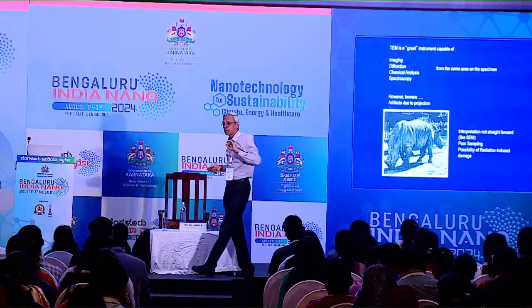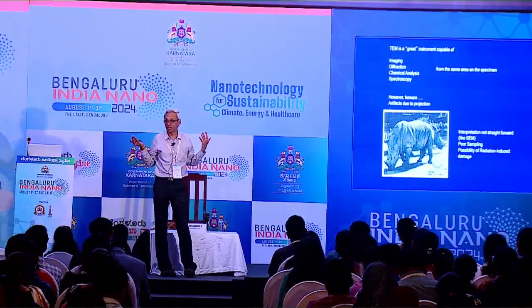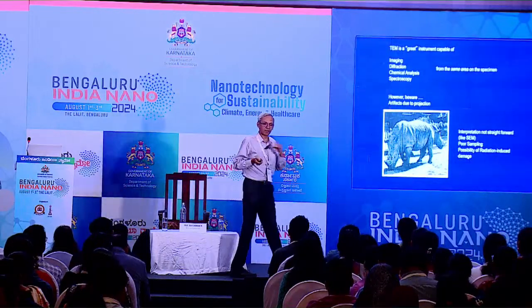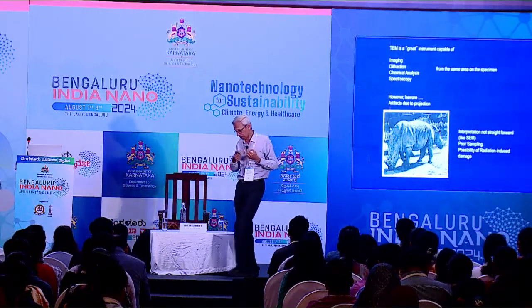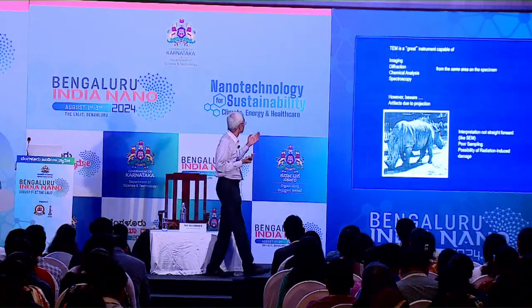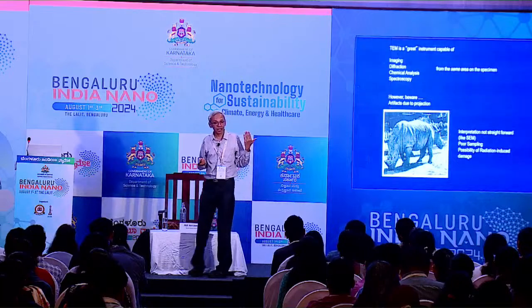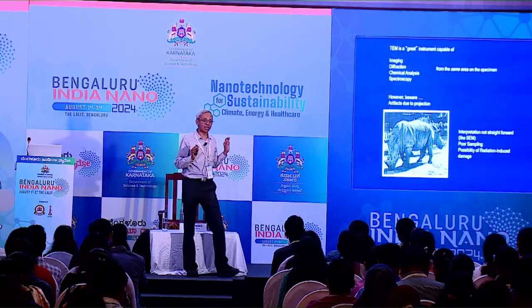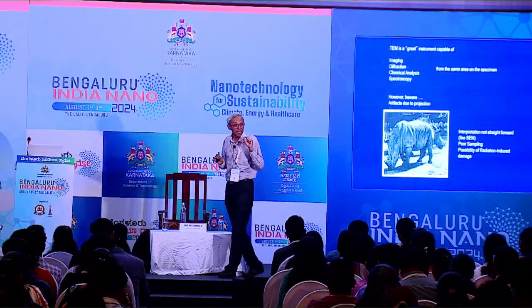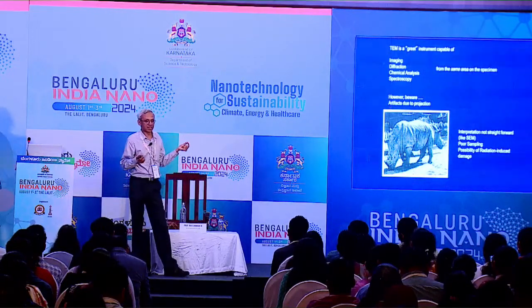Okay. There are individual techniques that are possibly better than the TEM for each of these things. We can do imaging, STM can give you atomic resolution. X-ray diffraction is still the gold standard because electron diffraction can never beat X-ray diffraction in terms of the accuracy, the third or fourth decimal place that you can get for your lattice parameters and so on. Chemical analysis, there are much better techniques which can do things at the ppm level maybe, and XPS of course is great, right? But what actually gives the TEM the edge is that you can get all this information from the same small region in the specimen, often approaching atomic dimensions. That is not possible with any other technique.